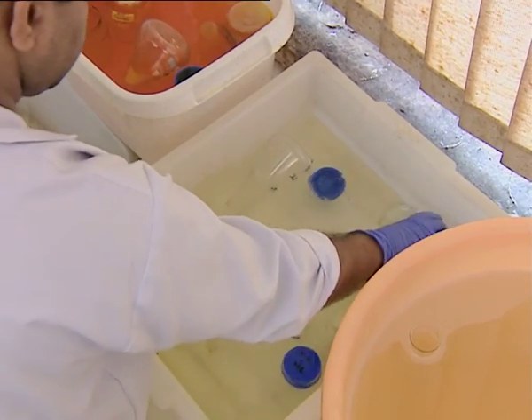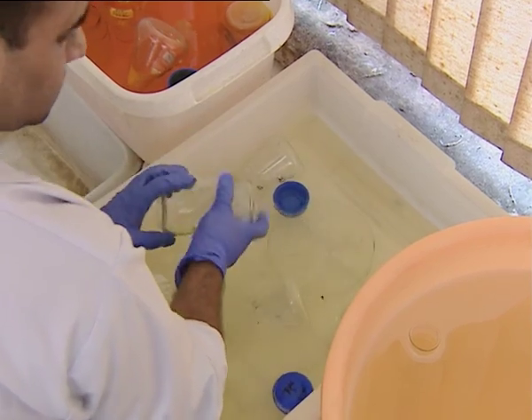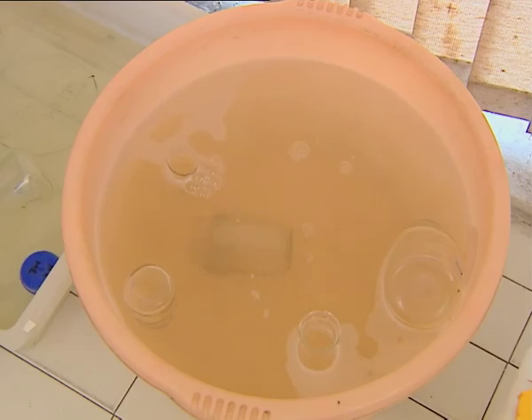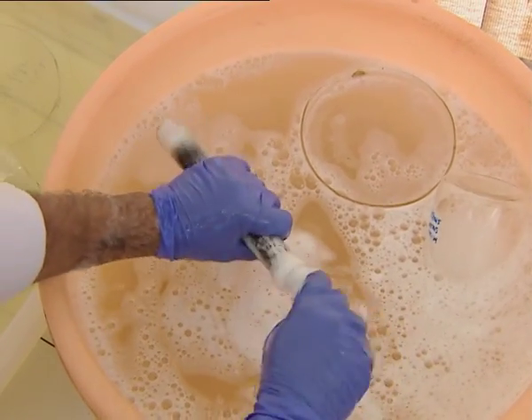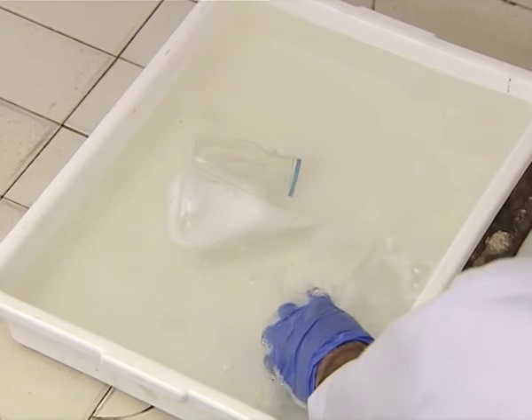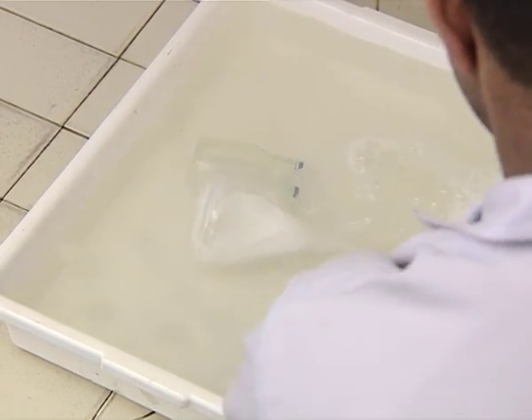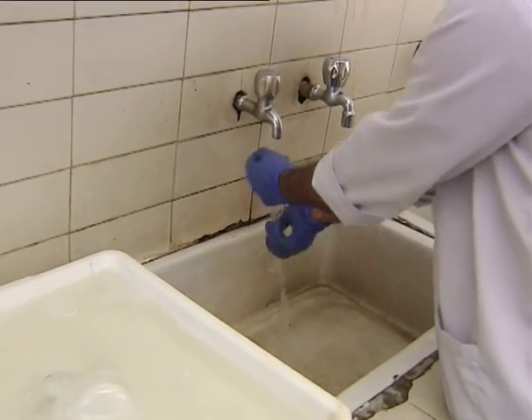After this, the glass and plasticwares are first rinsed with water to remove the chromic acid and then immersed in a tub full of detergent water and cleaned using hard nylon brushes. The glass and plasticwares are then immersed in another tub full of clean water, and then the detergent is rinsed off.